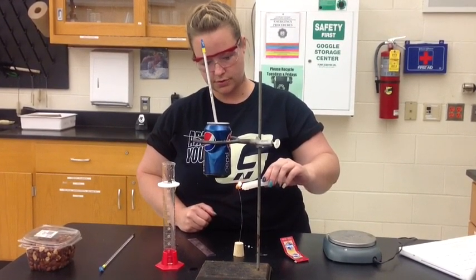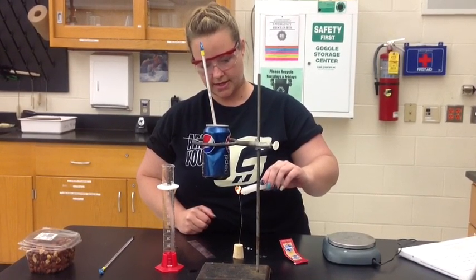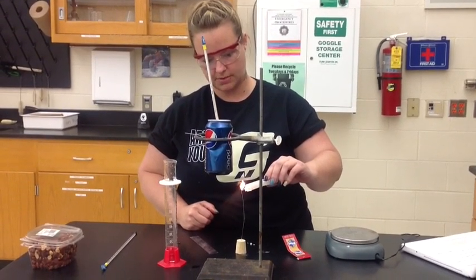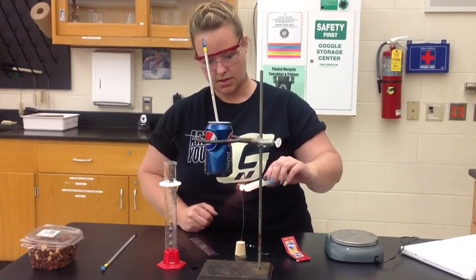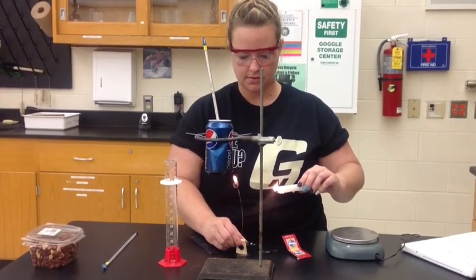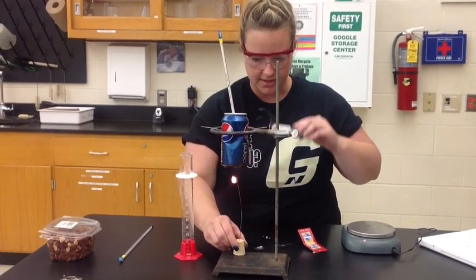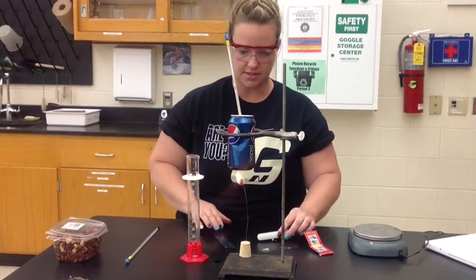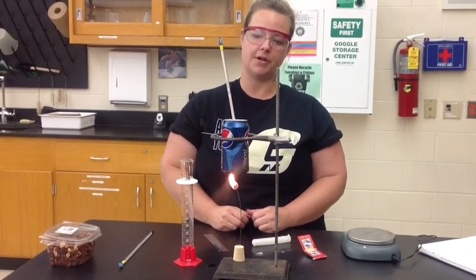Once the food source has caught on fire and is burning, I will go ahead and place it under the can with the water in it so that the temperature change can be recorded. You'll start to hear some little clicking when it starts to burn — a little popping that indicates the food source is on fire on its own. You're going to let that burn and heat up the water.